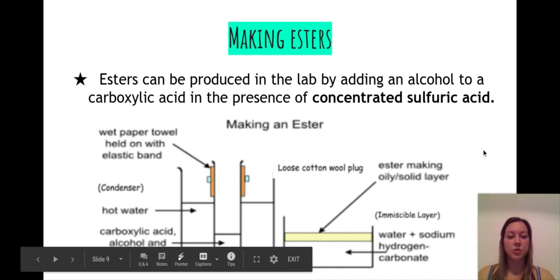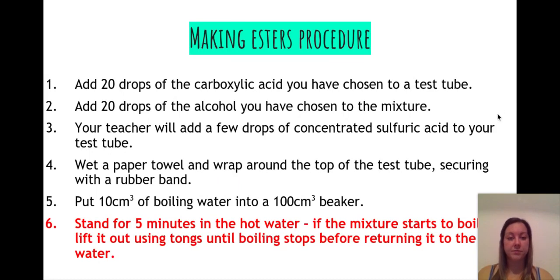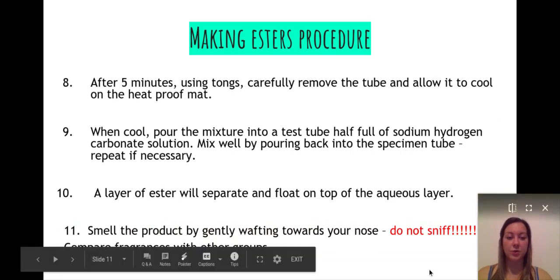So what you can then do is do the favourite chemistry waft. Do not sniff this. It will very much hurt your nose and your teacher will not be happy with you. So do the chemistry waft and you will smell some nice smelling esters once you're finished. You do need to be able to draw and label this entire diagram. Also, the SQA can ask you anything about it, so make sure that you are up to scratch with your making esters procedure. Obviously doing it in the classroom as well is going to help you out with that. So we don't need this procedure, but can I just highlight do not sniff.